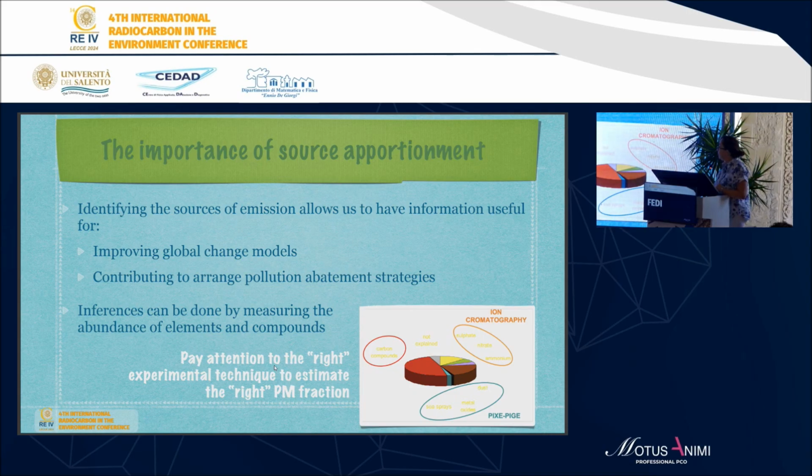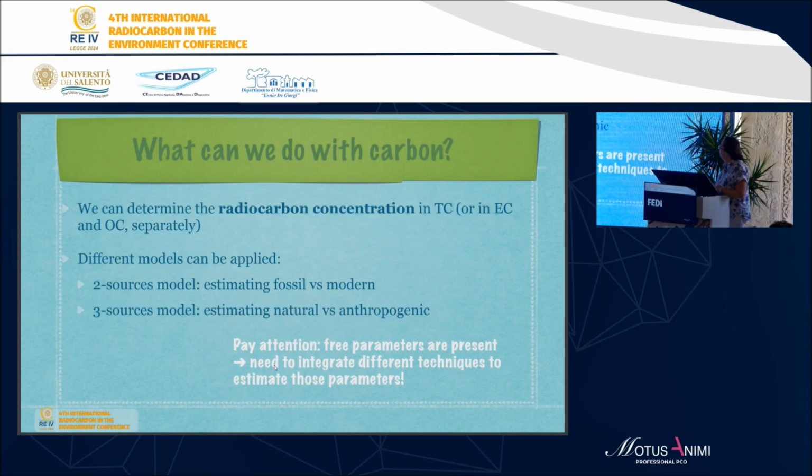So radiocarbon by itself cannot tell the whole story about the source apportionment, because we have to deal with different techniques if we are interested in different elements. For example, for sure, we have to combine other physical techniques such as ion beam analysis, PIXE and PIGE, but also some chemical techniques, just to identify and reconstruct as much as possible the situation of our particulate matter.